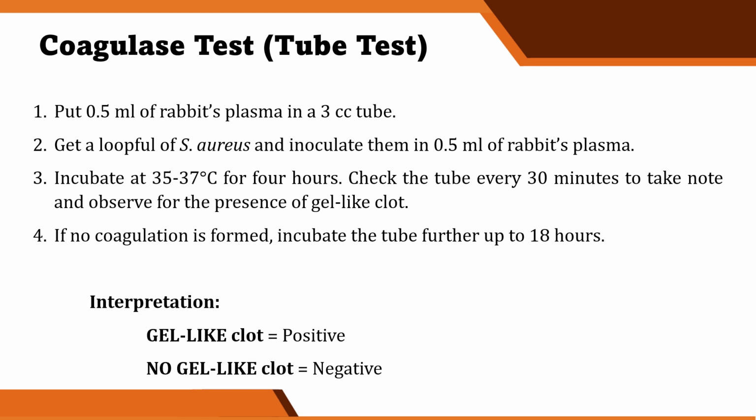And then, if wala talaga, after every 30 minutes under the 4 hours, further i-incubate pa natin siya up to 18 hours. And then, i-check natin siya sa dulo kung wala talagang na-form. Okay? So, nagkaroon ng gel-like clot, it was positive. Pag walang gel-like clot, that is negative tube coagulase.